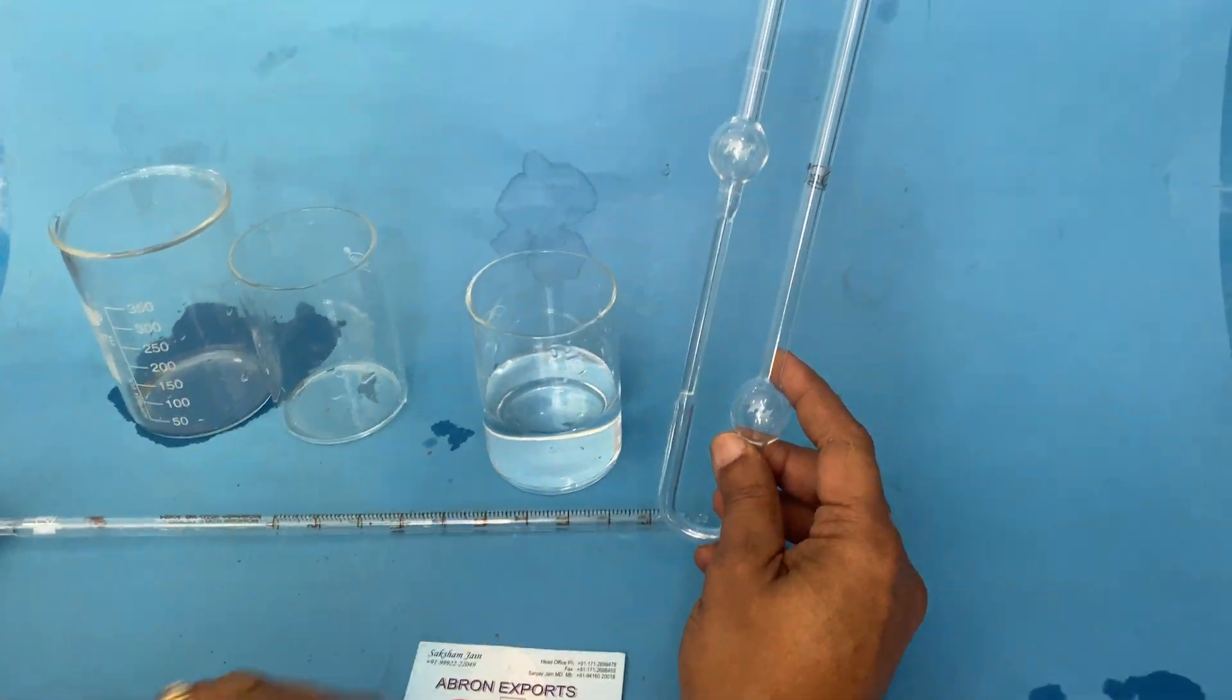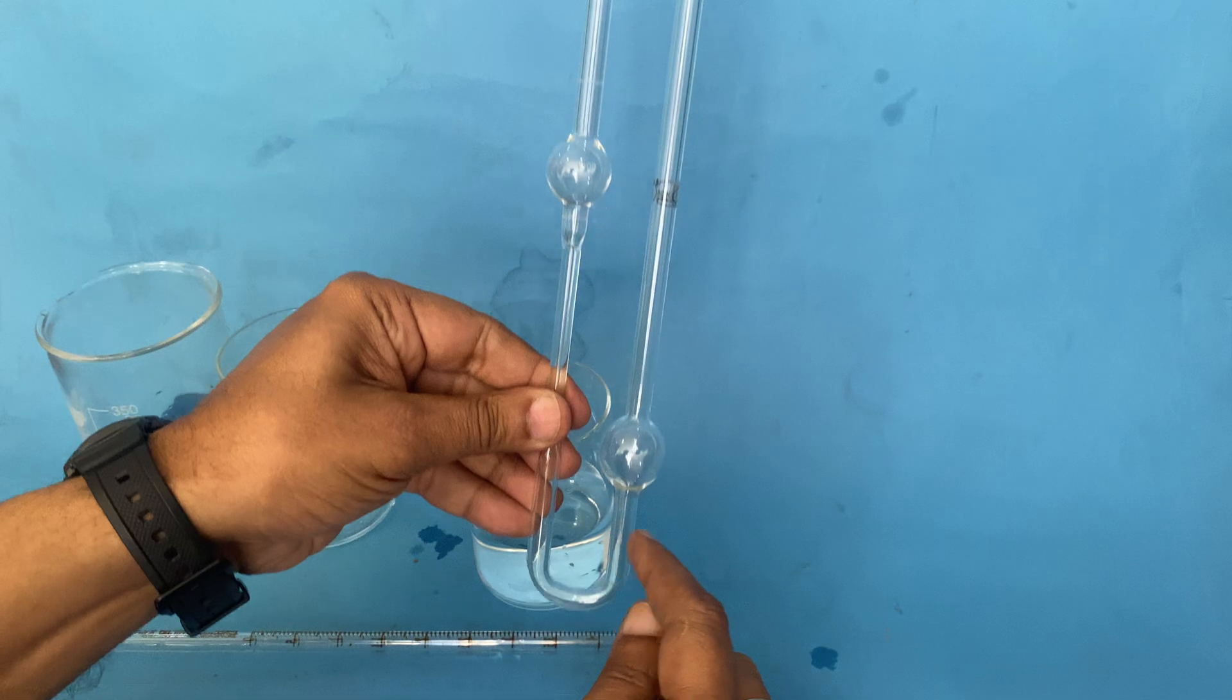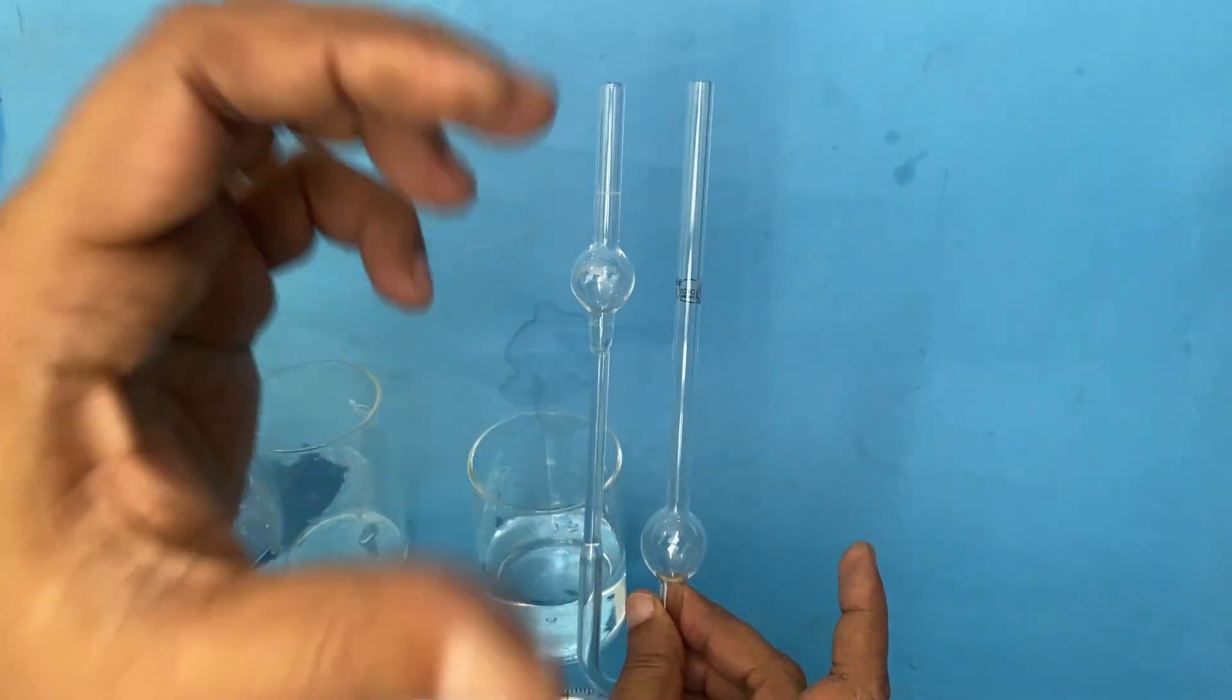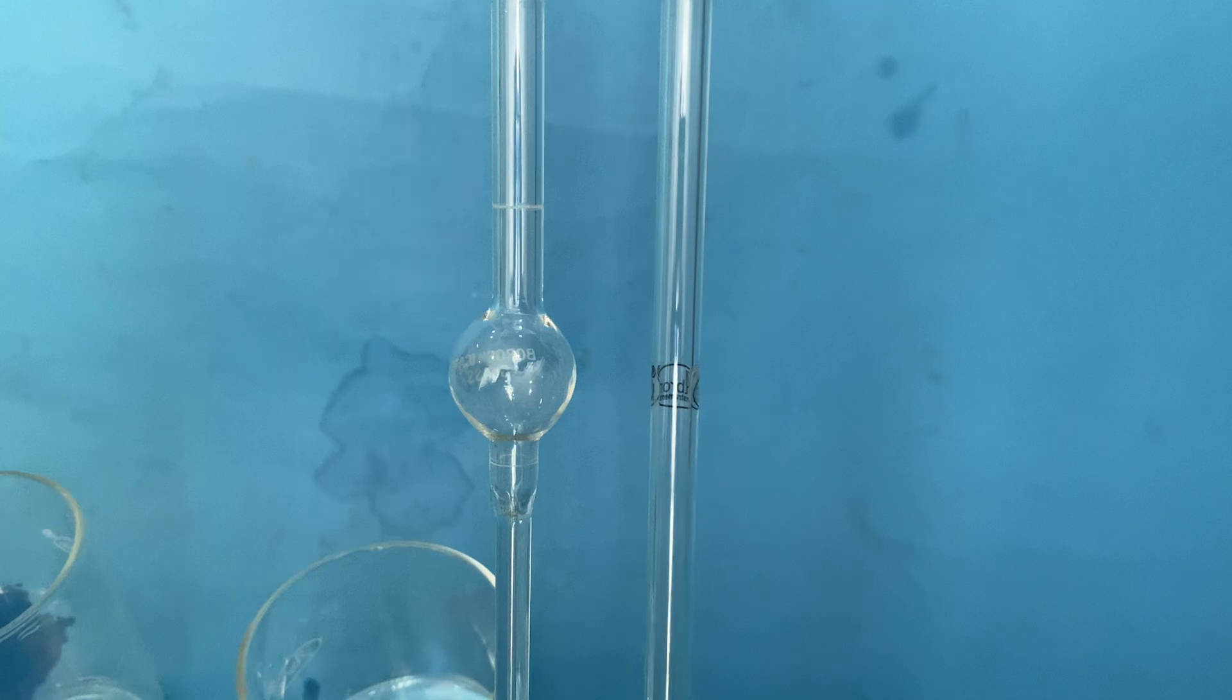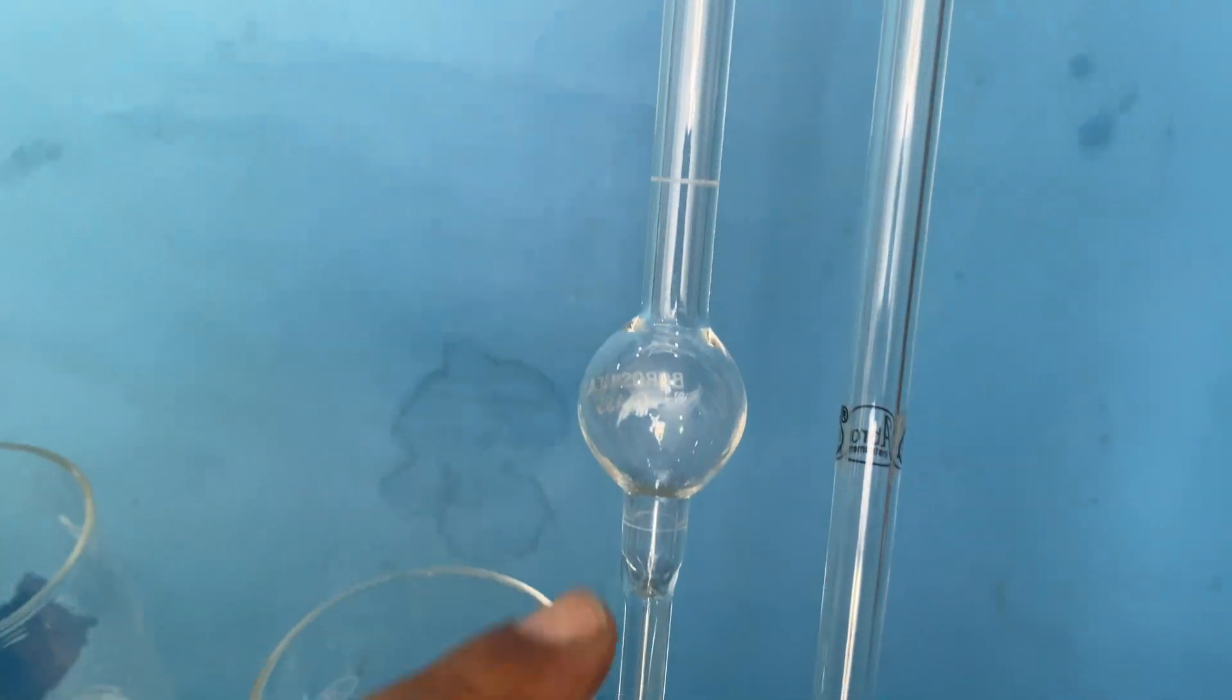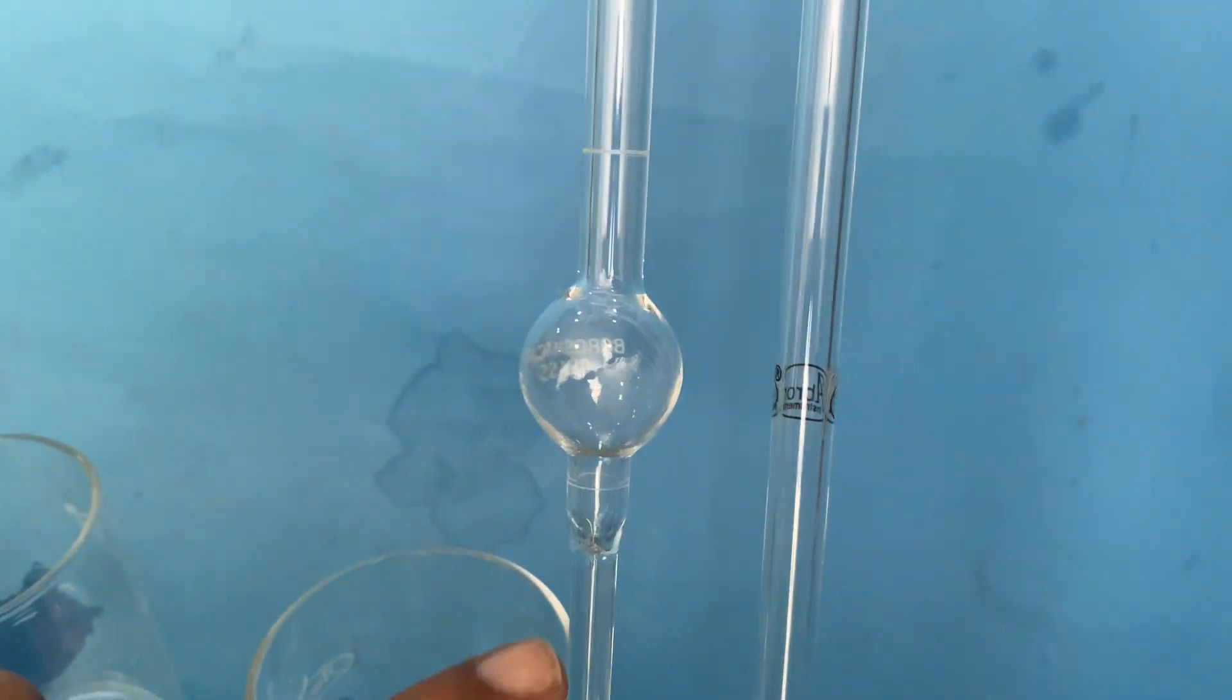This is an Abron viscometer, also called an Ostwald viscometer. It has two limbs, one smaller bulb, one bigger bulb, and a capillary tube here. You can see the capillary tube. The upper bulb has two lines, one on the top and one at the bottom. One is for starting, another is for ending.